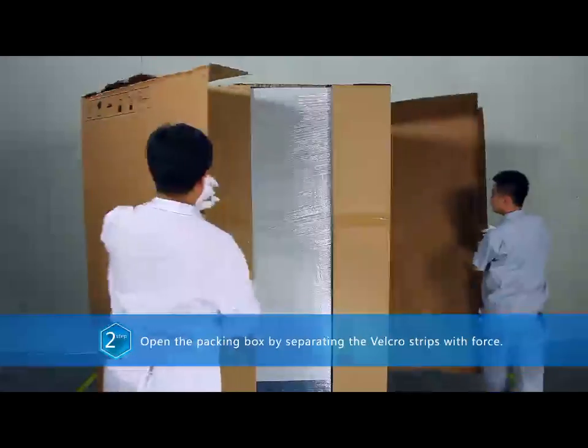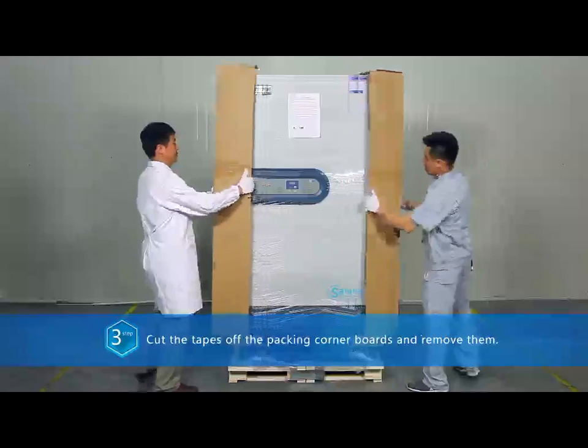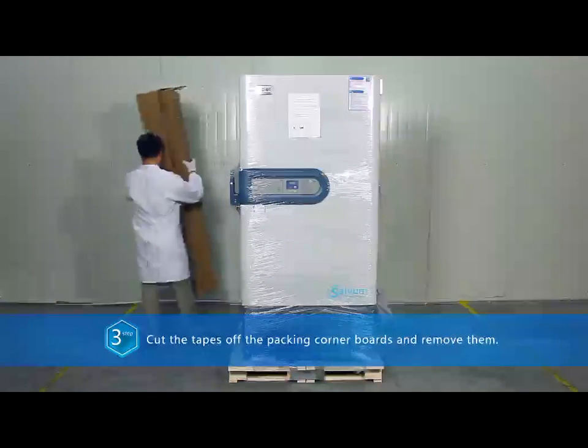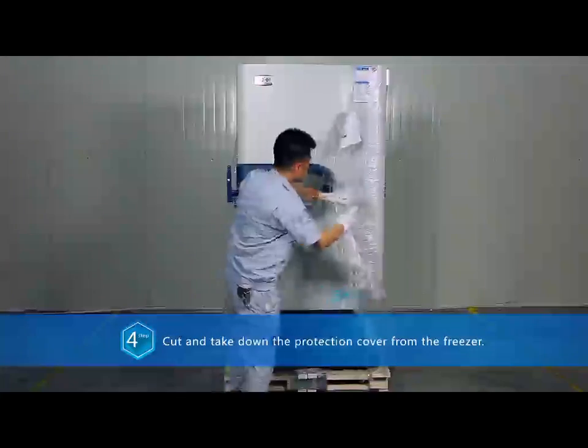Two, separate the velcro strips with force. Three, cut the tapes off the packing corner boards and remove them. Four, cut and take down the protection cover from the freezer.